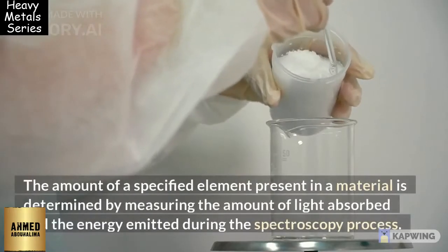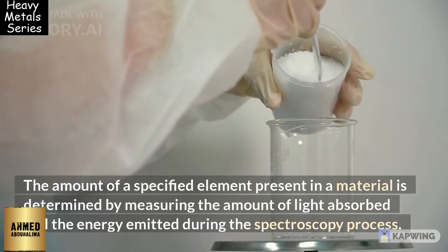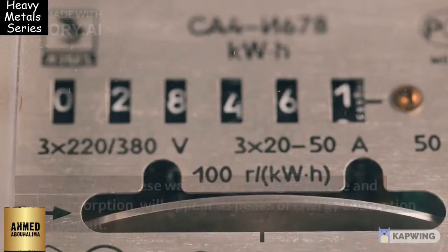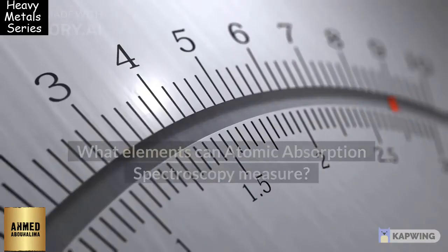The amount of a specified element present in a material is determined by measuring the amount of light absorbed and the energy emitted during the spectroscopy process. The changes in these wavelengths of light, before and after absorption, will appear as peaks of energy absorption in a readout.